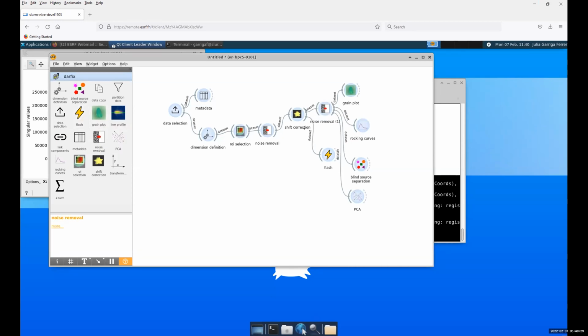No. I finally succeeded. I read the upgrade and I succeeded in installing the. Oh, yeah? great. Oh, good. Yeah. So you have the last version now. You have all the widgets?